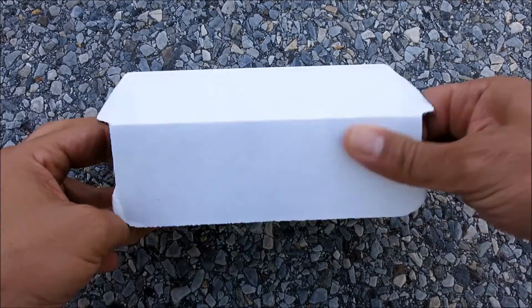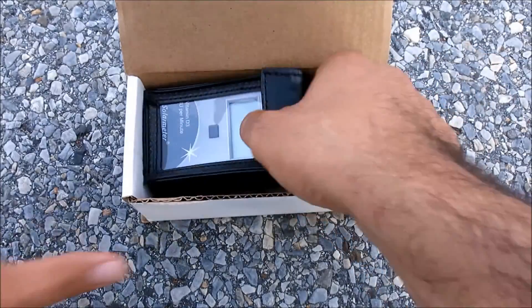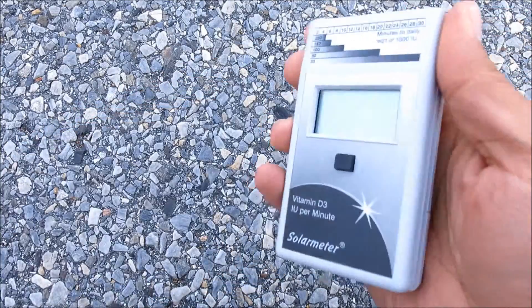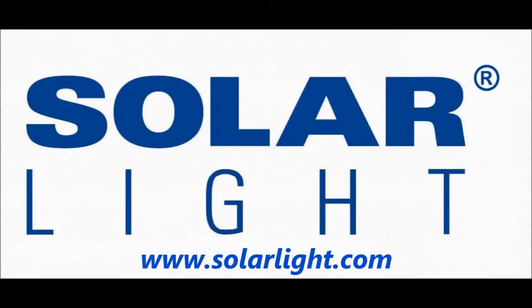Using the Solar Meter unit is easy. First, unpack it and store the calibration certificate for your records. Then remove it from its included carrying case. And finally, simply press and hold the push-button switch on the front face of the unit, aim the sensor window on the top panel of the meter directly at the UV source, and note the reading on the 3.5-digit LCD display.